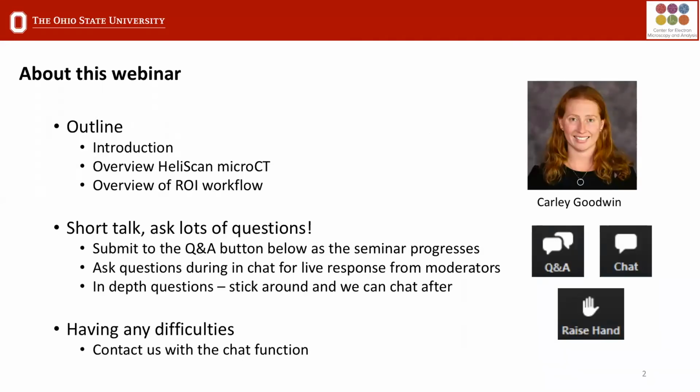Let's quickly go through the outline for today's webinar. If you have attended any of the previous webinars, you will know we usually start with a couple of introductory slides, which give a bit of background information about the presenter and also information about the instruments and resources available at CMAS. This will be followed by an overview of the HeliScan microCT, then the region of interest workflow. I would also like to mention that I've targeted this webinar at a beginner introductory level.